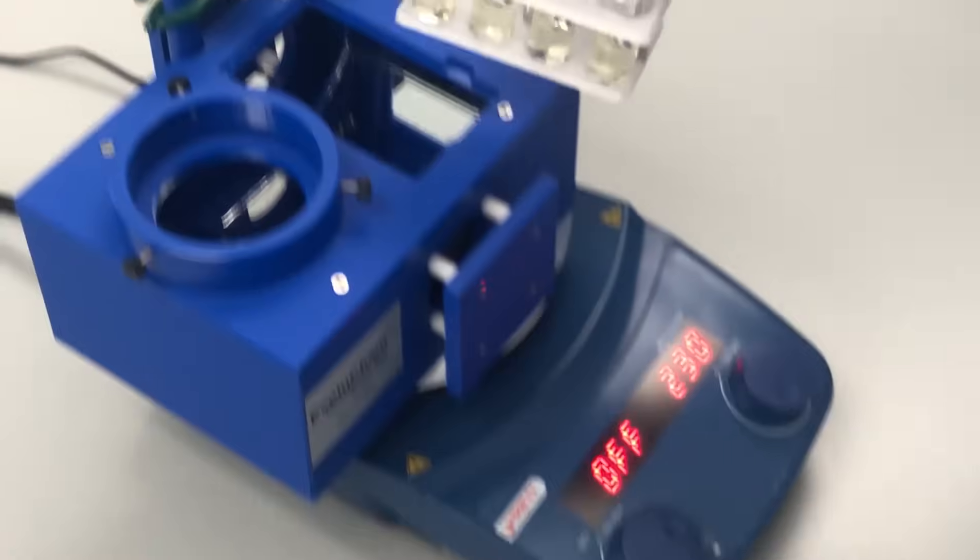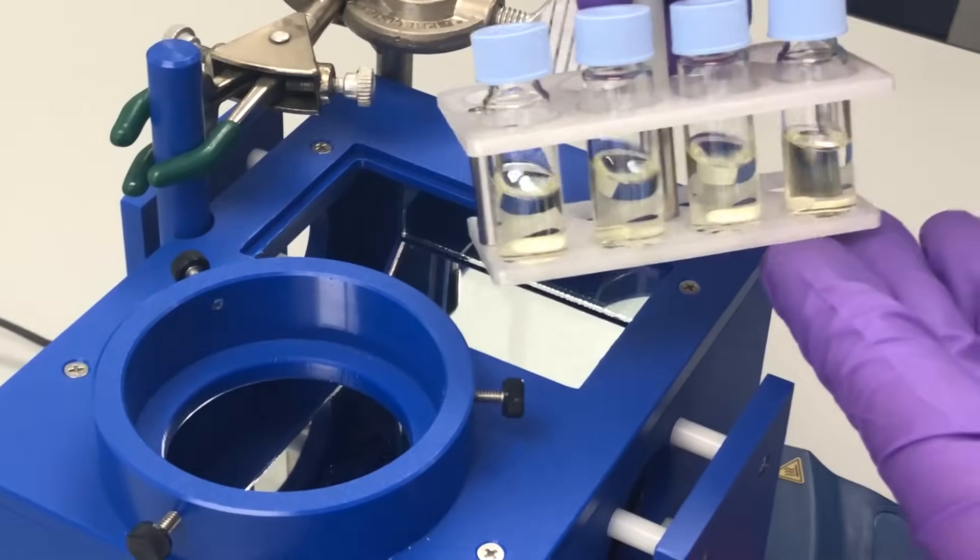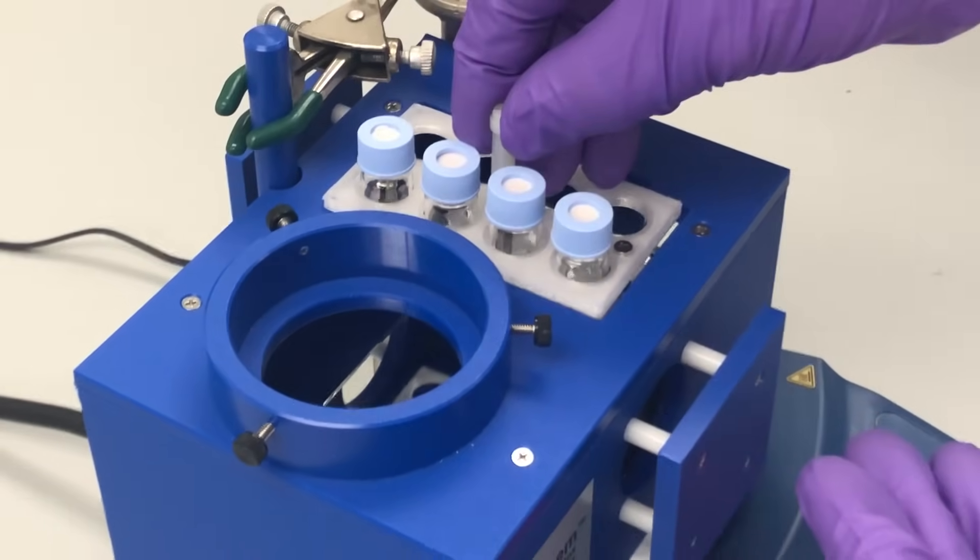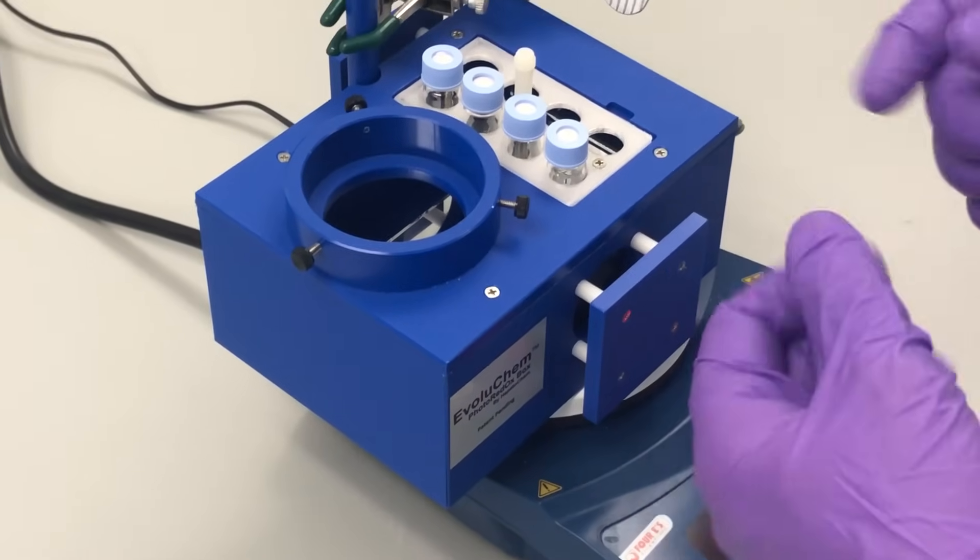If your experiments require precise environmental conditions, you should consider our temperature controlled photoreactor, the photoredox box TC, which easily connects to a standard chiller.